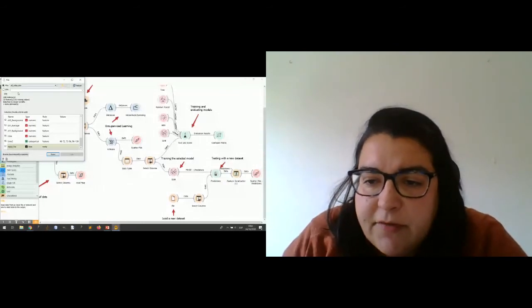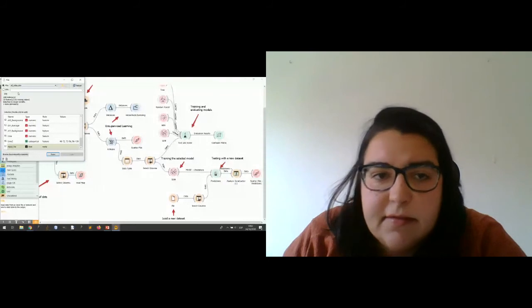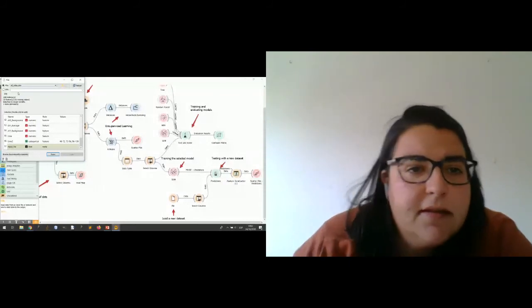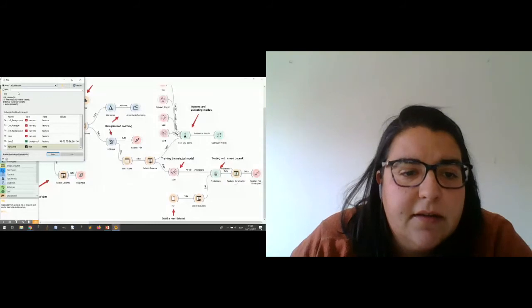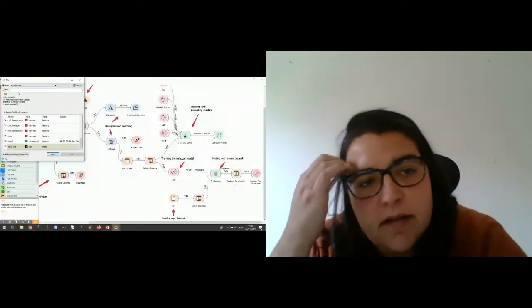Okay, I connect to the prediction, so the model is trained here and tested with this new data. So in prediction, I have the same information. I have the data for my new data sample, and here in this column, I have the cluster classified after the test with the model.